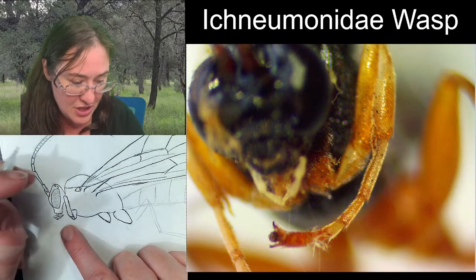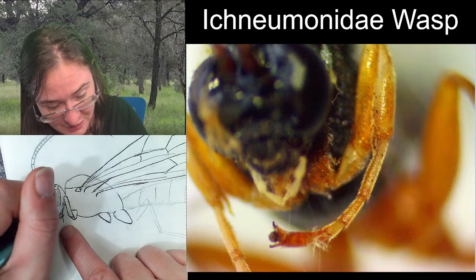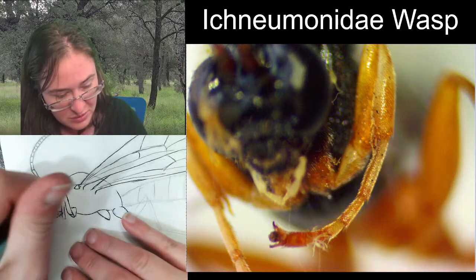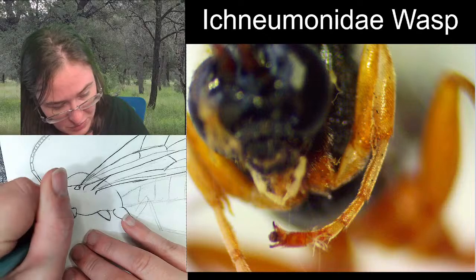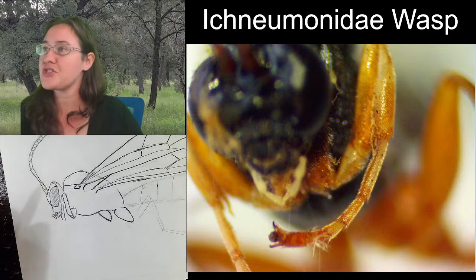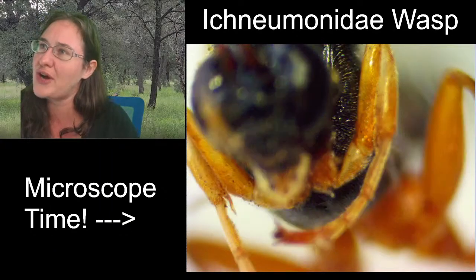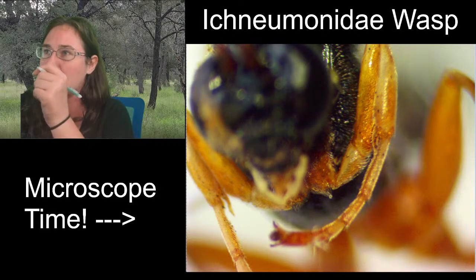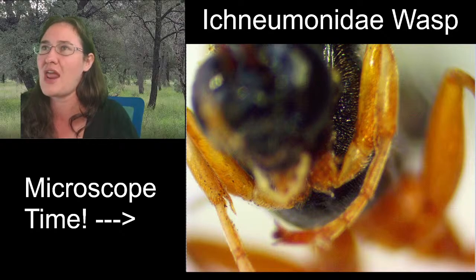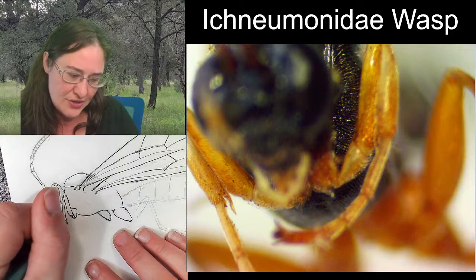And then the tibia is going to come down. And it looks like our tibia is a very similar length with the femur. Right, and then we have our tarsal segments. I do believe our wasp has tibial spurs. If you look over there on the right leg, you can see one, but I believe they are going to have two. It looks almost like it waves also. Instead of being a straight spur, it looks like it has a little bit of an angle to it. But the spurs are going to be on the inside, so you can add it kind of here.